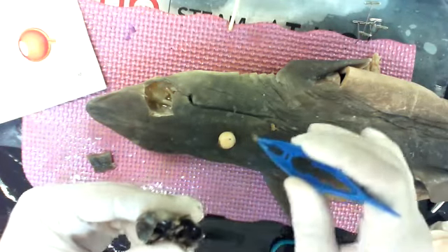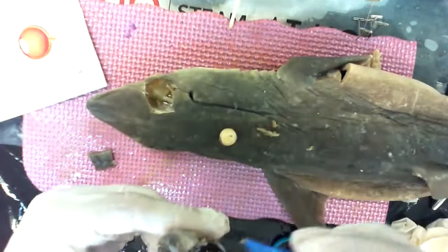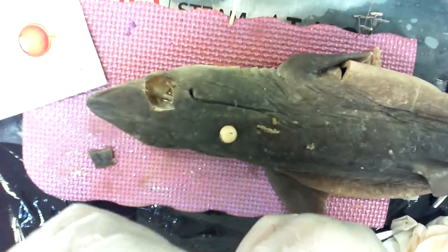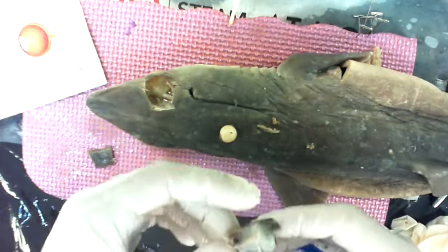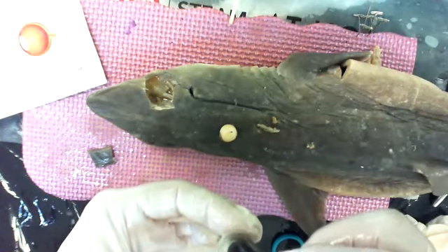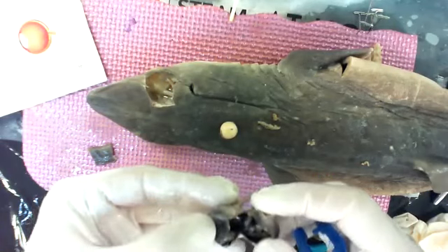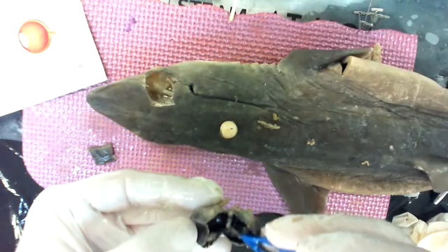Peel that. Hope we didn't accidentally rip it out. No, can cheat a little bit. Where was our optic nerve? Right there. Optic nerve is this little tube going in. So wherever the optic nerve is, where the optic nerve goes in is actually called the blind spot because there are no rods and no cones. So it's actually blank vision.